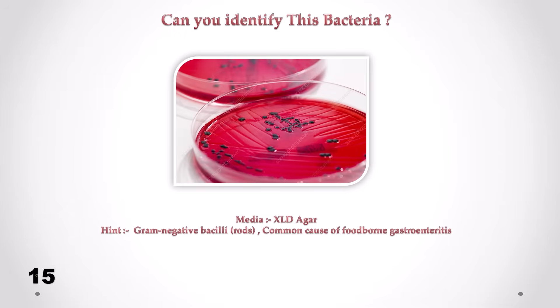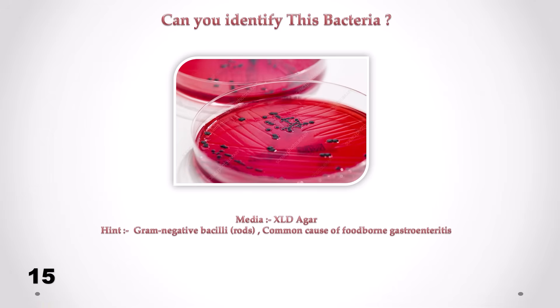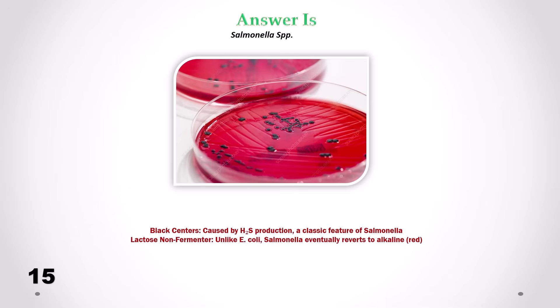Can you identify this bacteria? Correct answer is Salmonella. We can see black centers caused by H2S production — a classic feature of Salmonella. Also, lactose non-fermenter. Unlike E. coli, Salmonella eventually reverts the medium to alkaline, red.